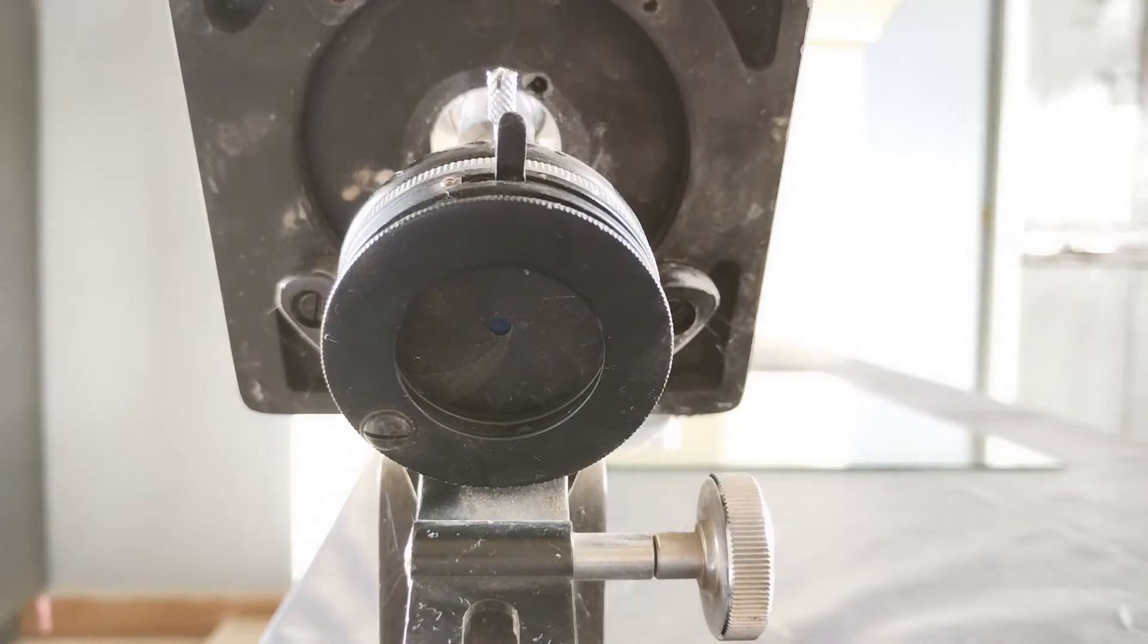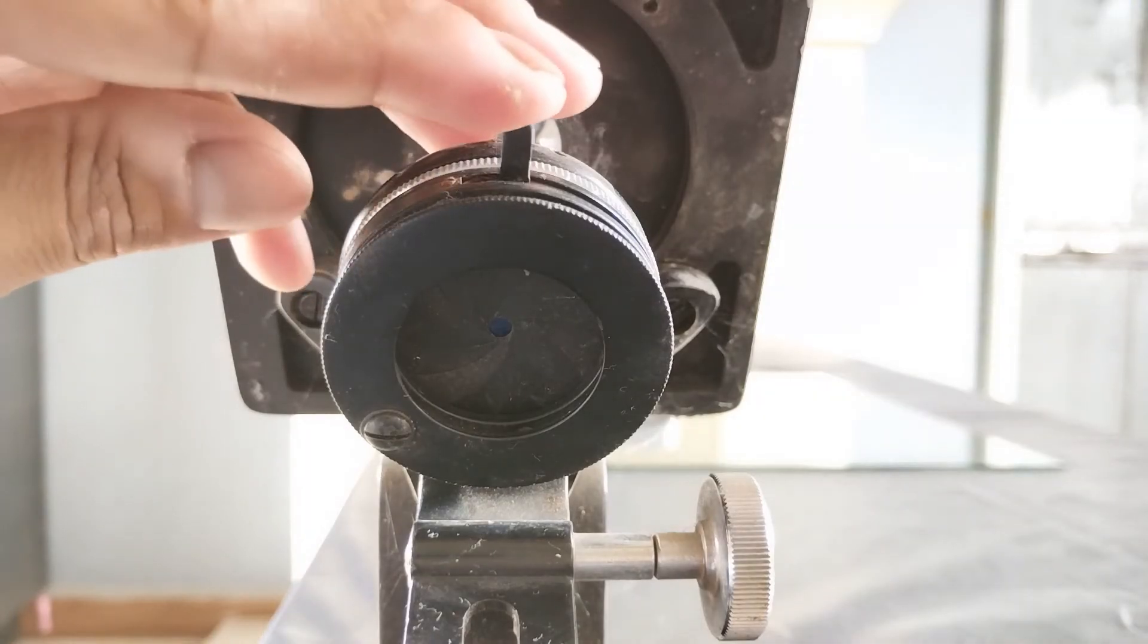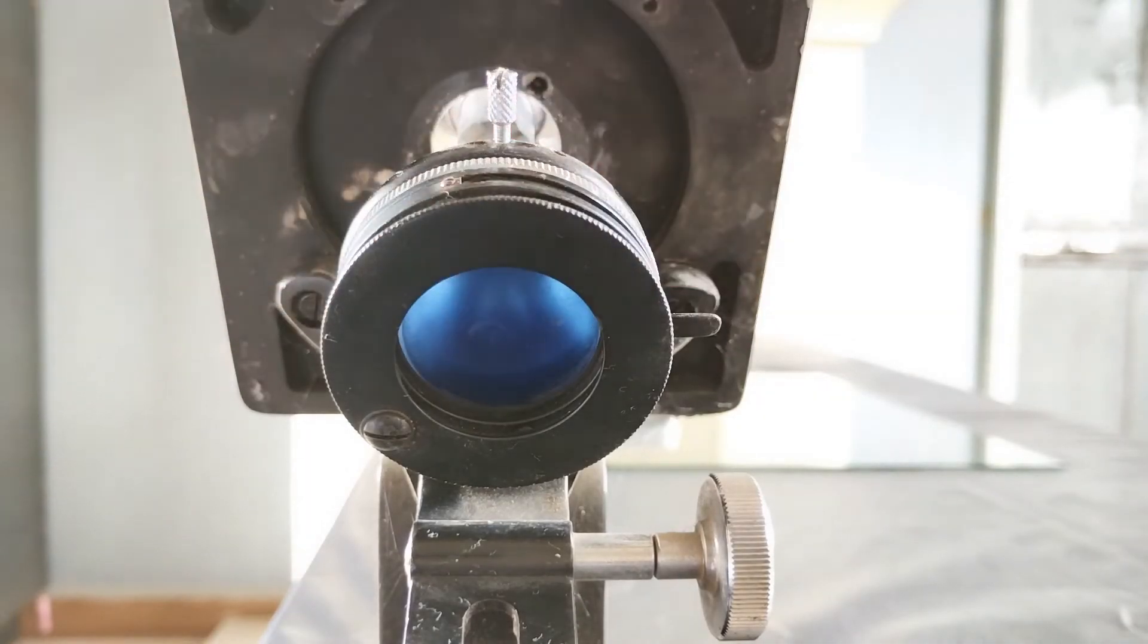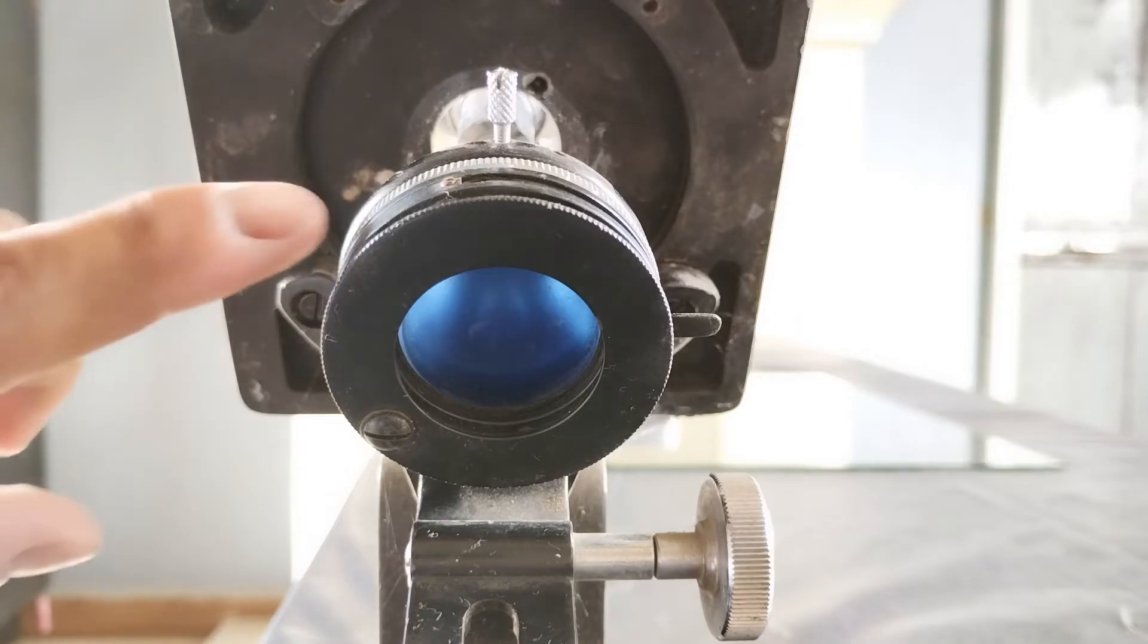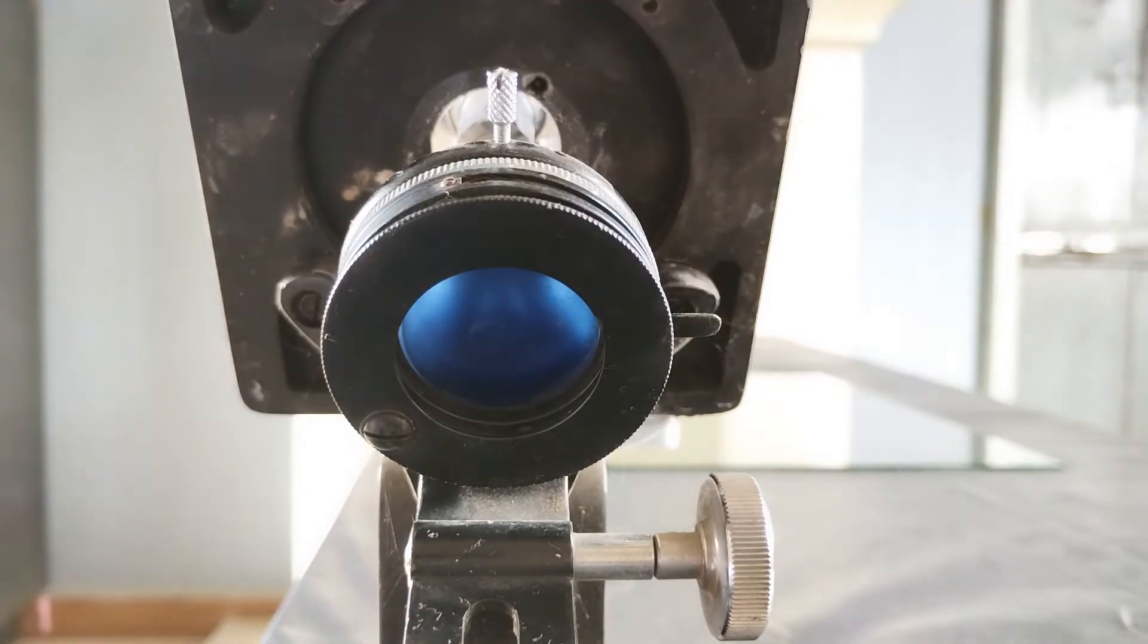Modern microscopes also come fitted with a blue filter underneath or above the iris diaphragm. The main advantage of a blue filter is that, irrespective of the color of the light source, the blue filter will render it colorless and give a clear white background in the field of view. This is both soothing to the eyes and also doesn't mask the true color of the specimen.